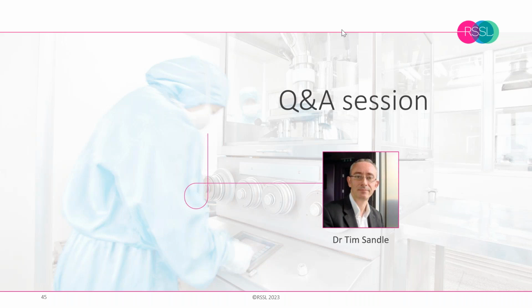Okay, we've got a couple of questions about the VHP gassing. So Richard asked, would the recommendation be to test occluded areas with a sporicide prior to VHP gassing? That can be done, I think, as a final fallback. The key thing is to eliminate occluded areas as much as possible in the design. But if you can't completely, and there is a minor risk, then yes, your only recourse is to go with a sporicide.